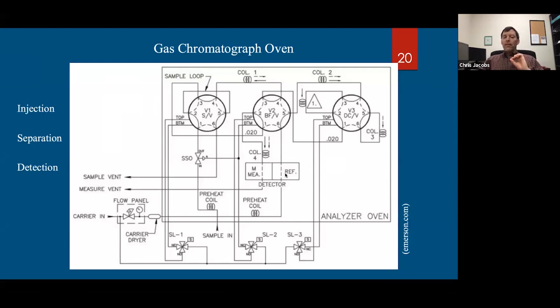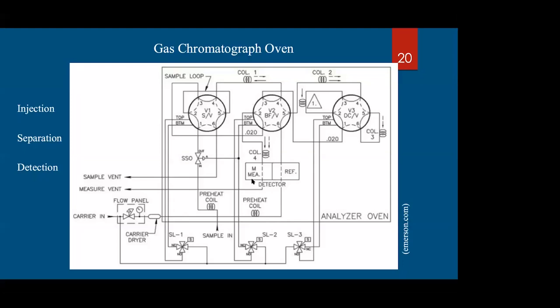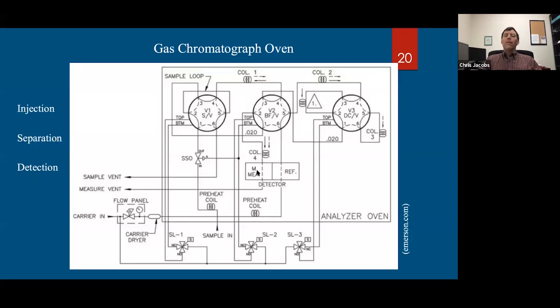So for example, if we look at it this way, the reference detector measures helium. When we have our samples coming out, the individual components coming out the measurement detector, we're going to have helium and nitrogen, helium and methane, helium and pentane, helium and butane. We need to subtract the helium from whatever that other component is, be it ethane or propane or methane, so we know what it is. So if we don't have some kind of a signature over here, we won't be able to subtract it over here from the measuring detector.